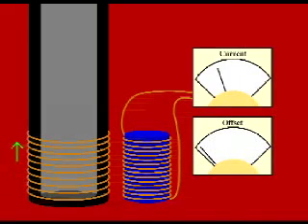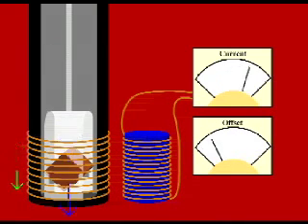Inside the sensing apparatus, the electromagnetic coil wrapped around the sensing area produces an oscillating magnetic field. The constantly changing field induces a current in the sensor coil nearby. When a sample is present, it becomes magnetic and responds to the shifting magnetic field produced by the first coil and oscillates with it, so that together they induce more current in the sensor coil. An anisotropic sample becomes magnetic to different degrees depending on how it is oriented to the coils. By measuring the sample in several orientations, scientists can calculate which orientations result in the most induced field. Although measuring the sample in 15 positions is not strictly necessary, it allows researchers to calculate error.